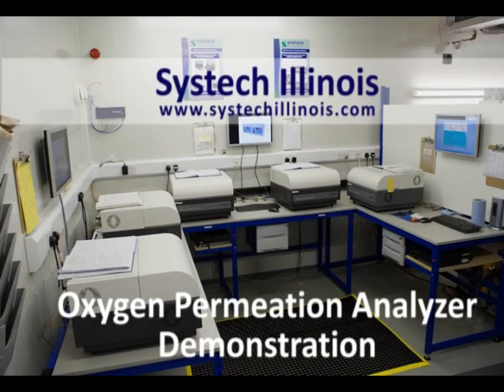Here is a brief introduction to the Systech Illinois Model 8001 permeation analyzer. This is one of our testing labs. We test samples as well as provide analyzers.